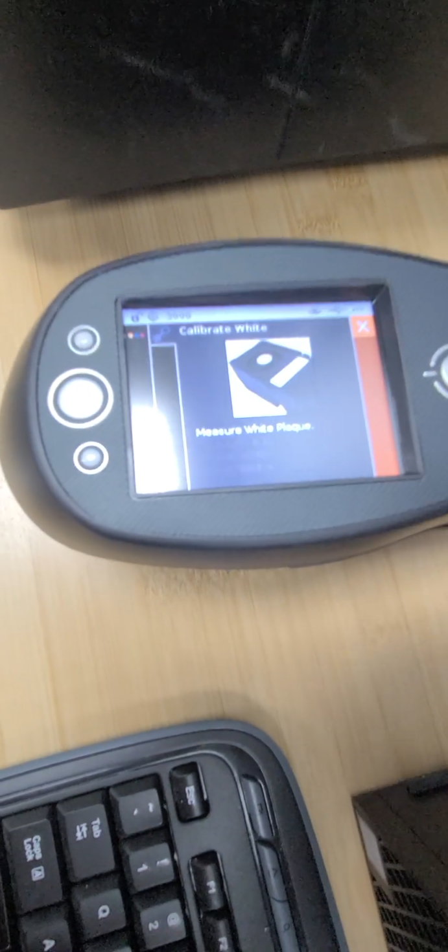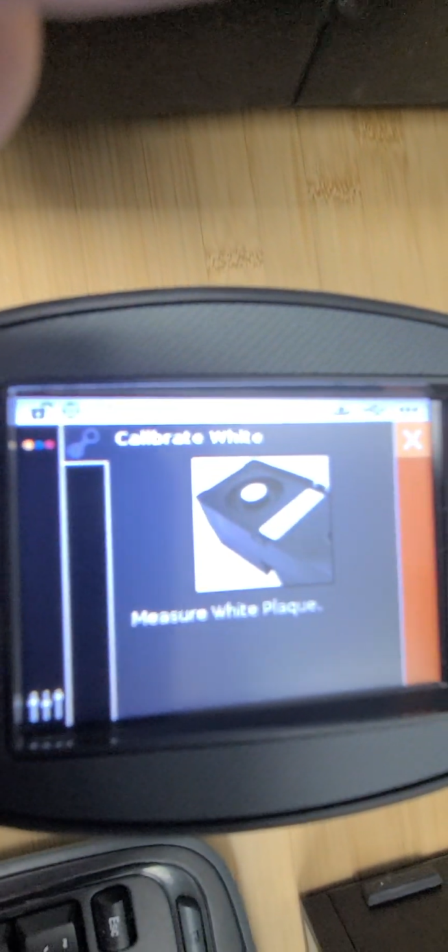You get a message that says standardized mode 0 default, then press OK, then press OK, then calibrate. So we're going to click OK. Then it says after spectro is calibrated, we want to push OK. So we're going to go to the unit, and you can see that it turned colors, right? It says calibration valid. I'm just going to arrow over and X out of that. The message it's telling me says calibrate white.